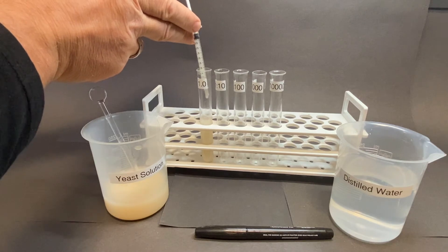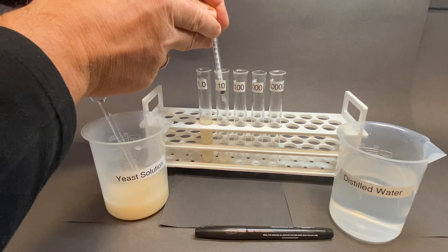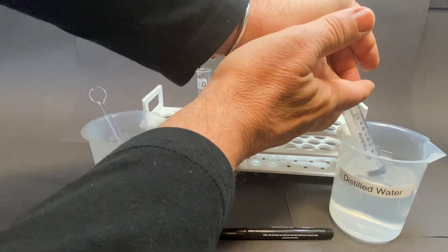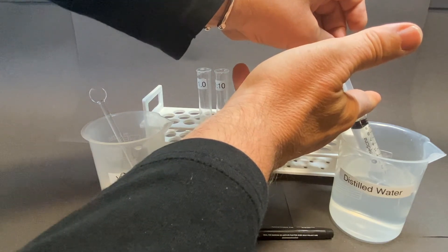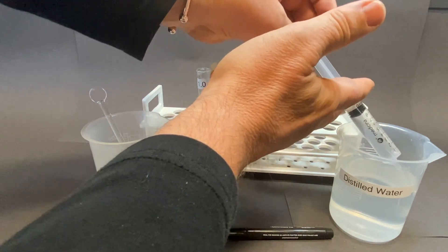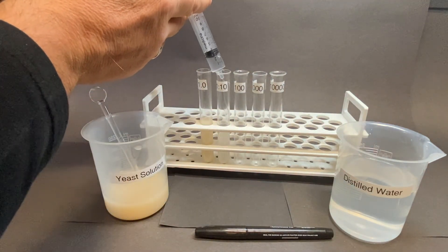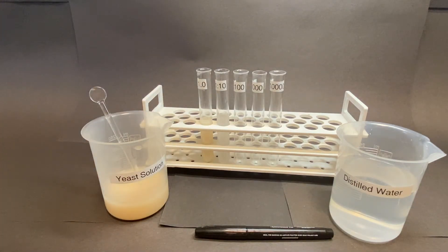Ensure the bottom of the plunger is on the 1-milliliter marker. Using the 10-milliliter syringe, draw up 9 milliliters of distilled water and add this to the 1 milliliter of the sample in the tube marked 1 in 10. This gives a total sample volume of 10 milliliters, ensuring the 1-in-10 dilution.